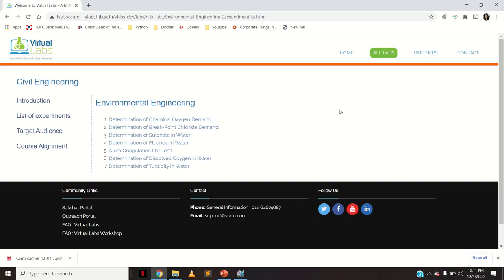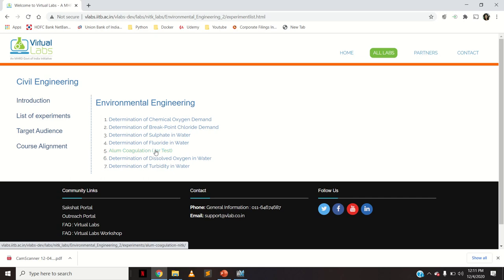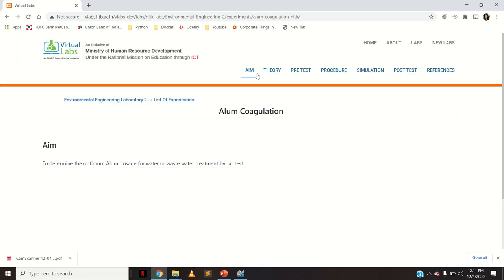Hello everyone. Today we will see how to find the optimum dose of coagulant using jar test apparatus. This is the virtual lab of IITB where under environmental engineering you have a list of experiments, including alum coagulation jar test. The aim is to determine the optimum alum dosage for water or wastewater treatment by jar test.